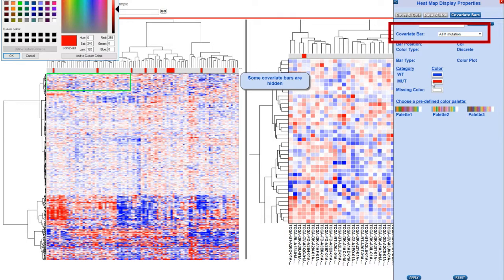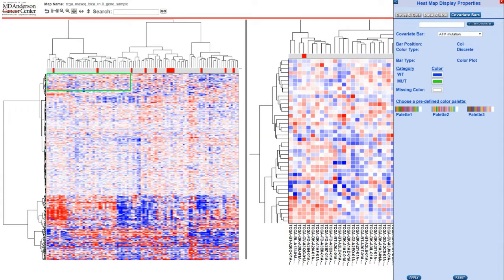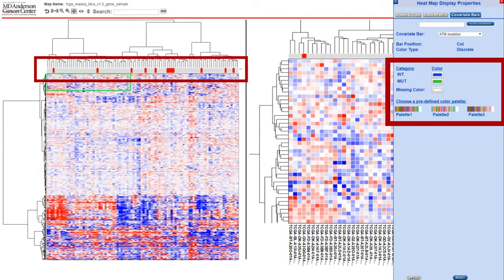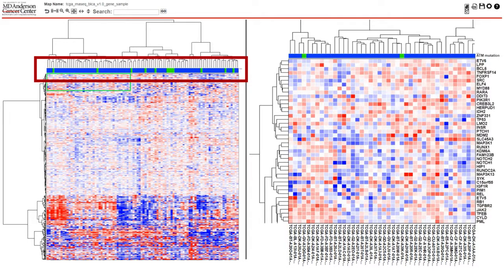The coloring scheme of the selected covariate can then be modified. At the top is a drop down so that you can select your covariate bar, and under category you are given the option to change the colors for said categories. There is also a missing color option or the ability to choose a predefined palette.